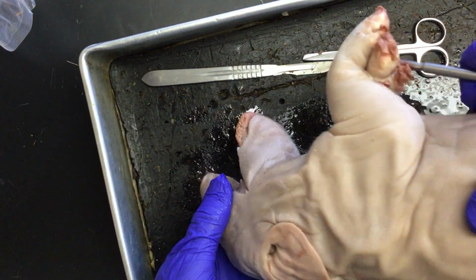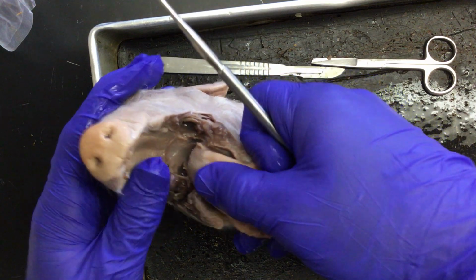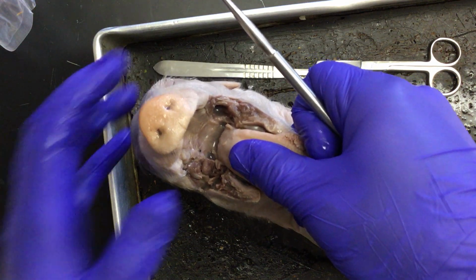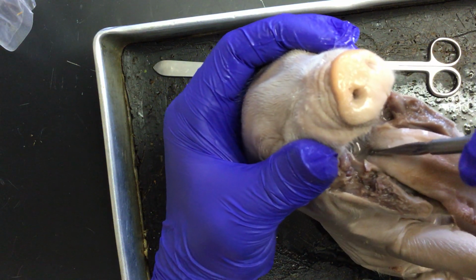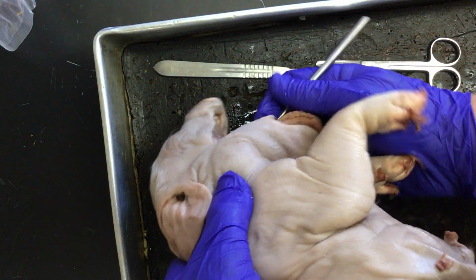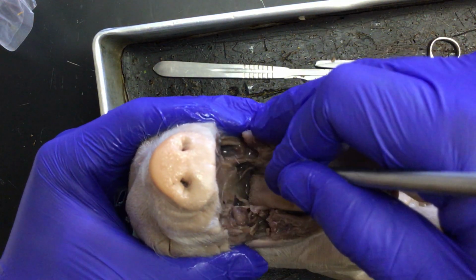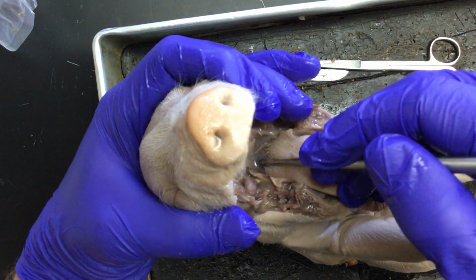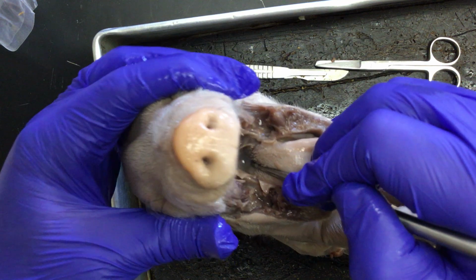I'm going to drain the pig just a little bit so you can see back in there. All right, so structures that we're going to note at this point in time. The pharynx. Pharynx is this. Drain the pig just a little bit more. The pharynx is the passageway at the back here that's just below the surface of this liquid. It's a common pathway for food.